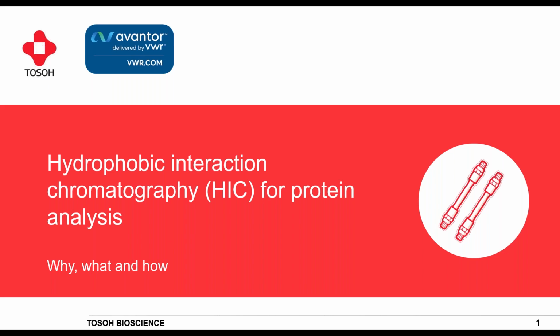My name is Martina Witzenbacher and I'm here at Avantor site, the portfolio manager for chromatography consumables. Together with my colleague Didier Sember, we are the hosts of today's webinar. Today we will be hearing in our webinar about hydrophobic interaction chromatography, a versatile method for ADC and protein analysis.